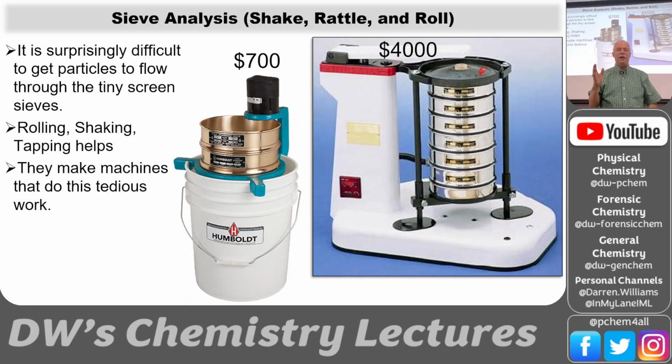Now it's surprisingly difficult, let's say you have a muddy sample in that top sieve, to get it all to go through. You'll have some big rocks in there, what I call pickers. Those will obviously be trapped by that top sieve. But then you have the particles that get close to that sieve, and they're all adhered together, so you've got to wash them, and you've got to tap the sieve so that if a particle doesn't quite line up, then you tap it and it lines up and goes through. We want that to happen. And all the mud or sample gets off to one side of the sieve, so you've got to rotate the sieve.